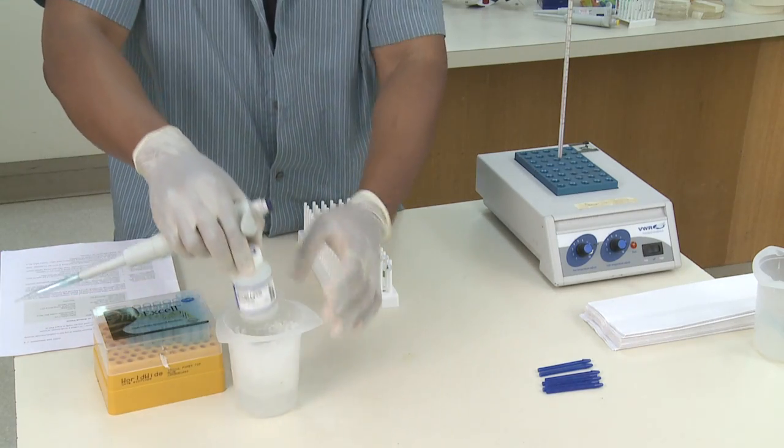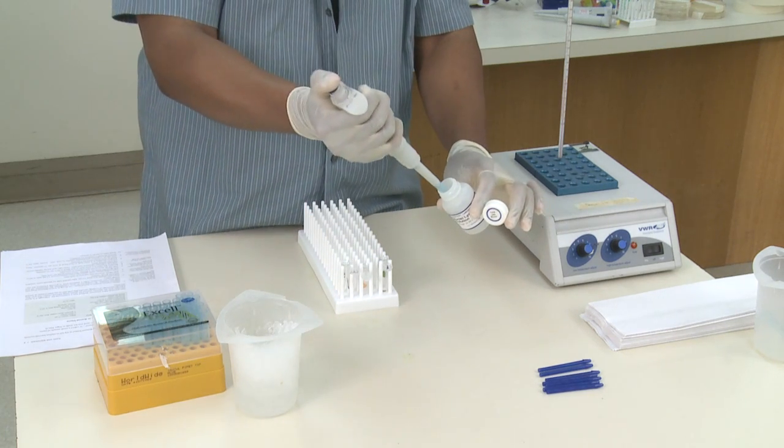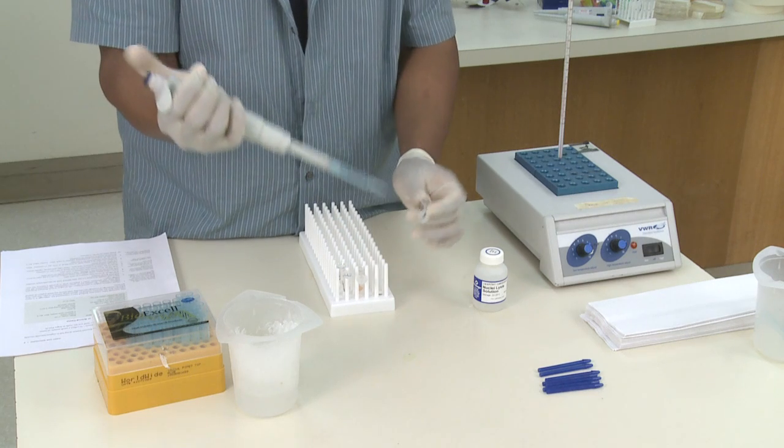My lysis solution is already on ice, so I'll carefully get 100 microliters, cap that back up, and add that 100 microliters to my first sample.